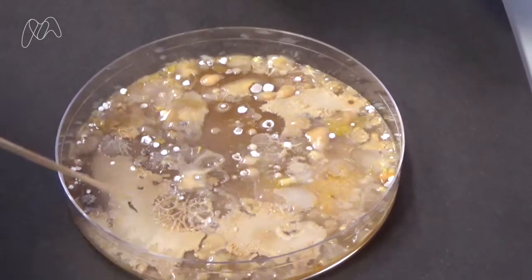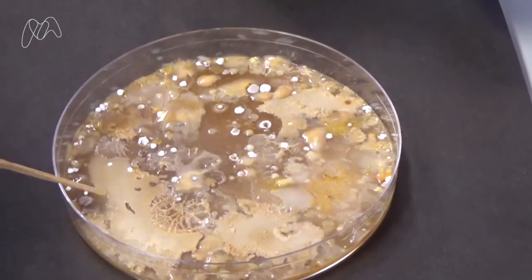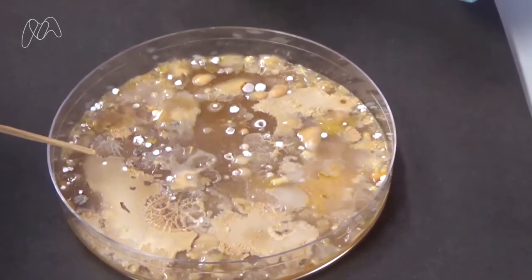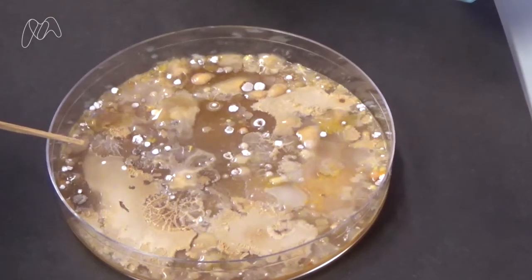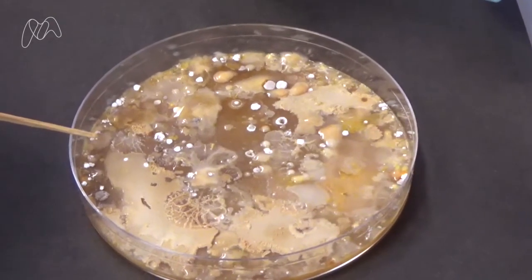Others spread out in a kind of spidery web, and that's because they're all different species, and they all grow in different ways. Have a look at your plate and see what kind of bacteria you can identify.